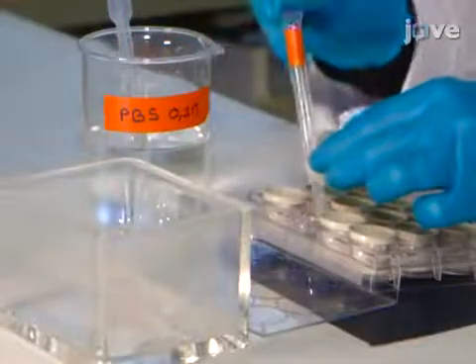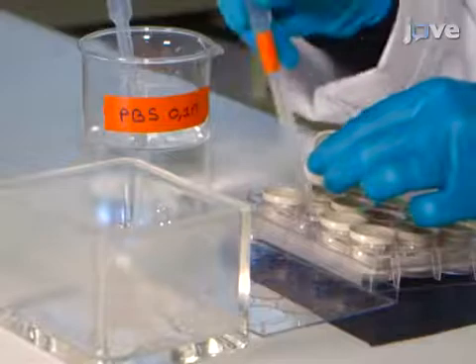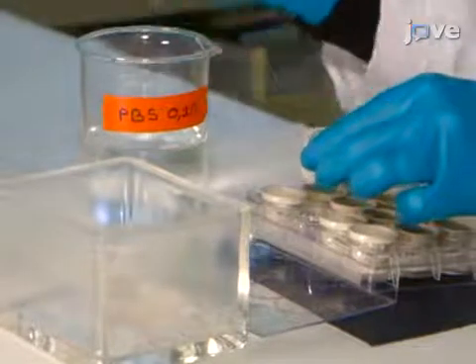In this step, wash the sections with 0.1 molar PBS for 10 minutes at room temperature and repeat the procedure three times.